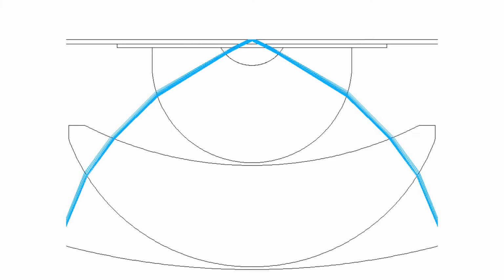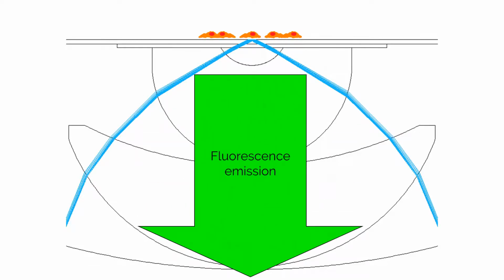Let's imagine again that we have a monolayer of fluorescent cells growing on the glass cover slip. In this zoomed-in view of the objective lens model, we can see that the collimated laser beam approaches and internally reflects from the front focus of the objective lens with a well-defined angle of incidence. And look at that, we've achieved the conditions for total internal reflection illumination using a high numerical aperture objective lens, and any fluorescent light generated by the sample and within the cone that defines the objective lens numerical aperture is captured and directed to the camera after passing through appropriate emission filters.